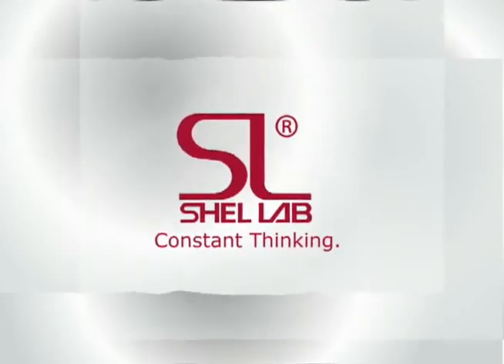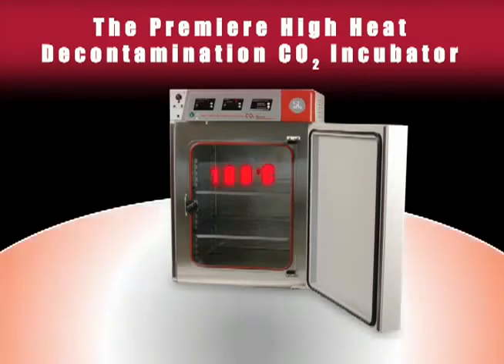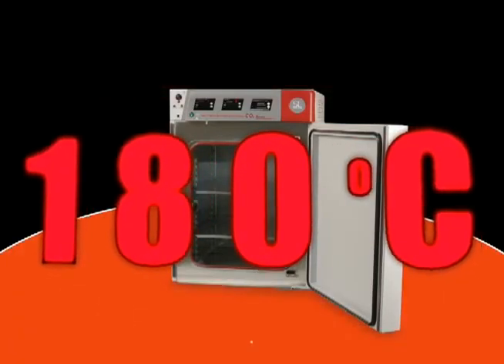The Shell Lab 3552 represents the latest in design and engineering from Sheldon Manufacturing Incorporated. For more information on all of our products and services, customer support, or to find your Shell Lab representative, please visit shelllab.com.